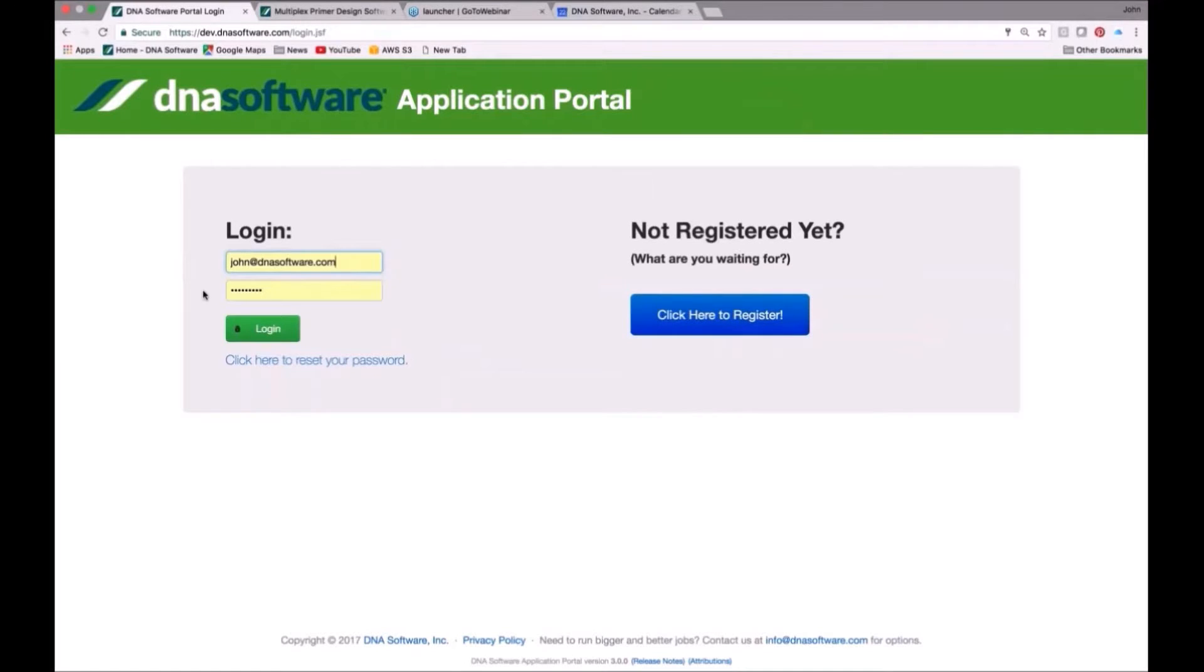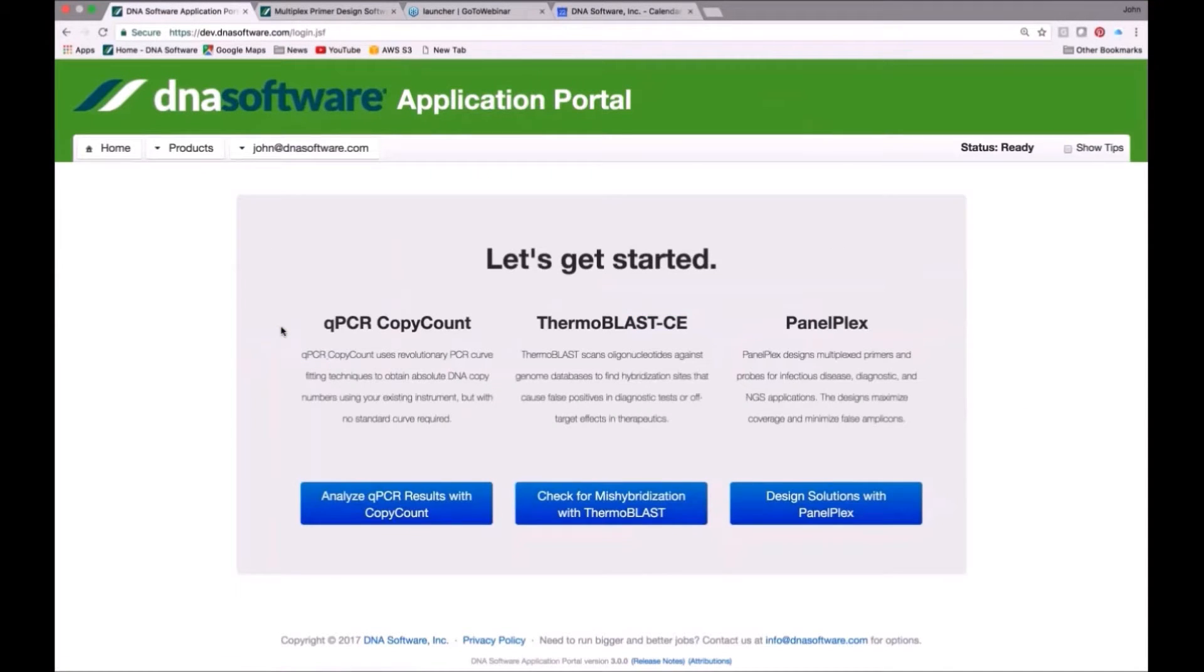This is the login to our DNA software application portal. It's easy to register if you haven't already, but you come into the portal and you can see our three products.